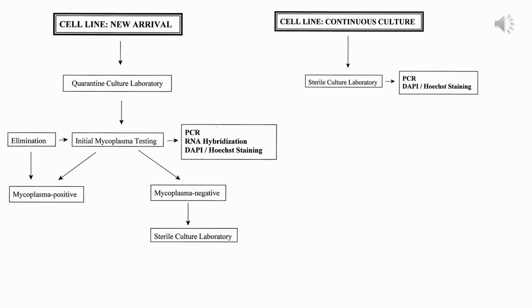So after 10 days, or at least after 7 days, you can check if there is any positive Mycoplasma growth. Then you can see there are microscopic colonies, some 100 to 400 micron diameter size colonies. They show what is typically called a fried egg appearance. So if you have such an appearance on the surface of the agar, then that indicates Mycoplasma contamination.